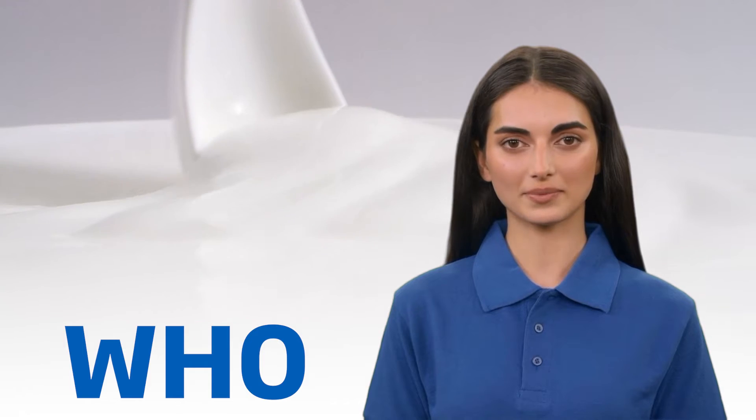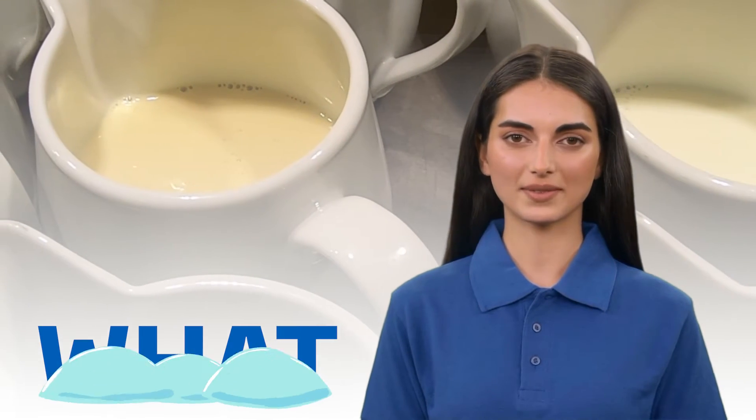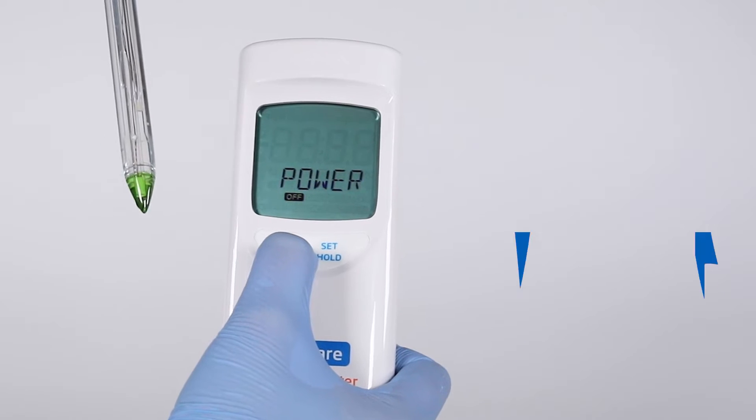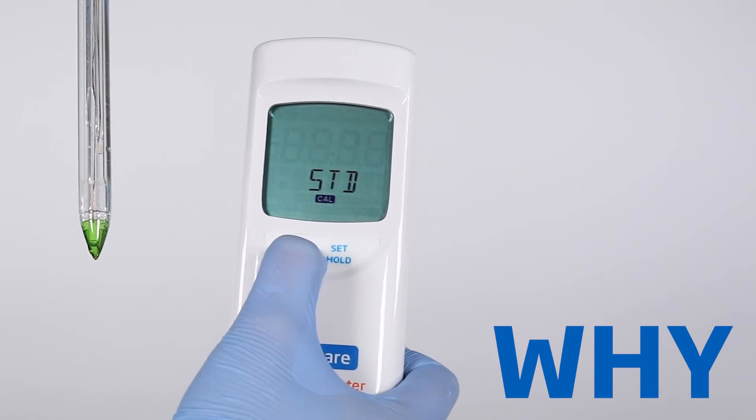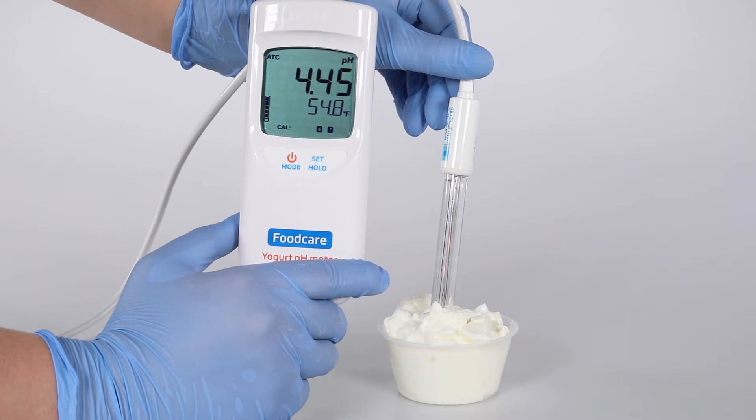The HI99164 is a yogurt, sauce, and condiment maker's dream, measuring pH and temperature across various semi-solid matrices. Its open junction allows for easy cleaning and reduced clogging in high-protein concentrations, such as yogurt.